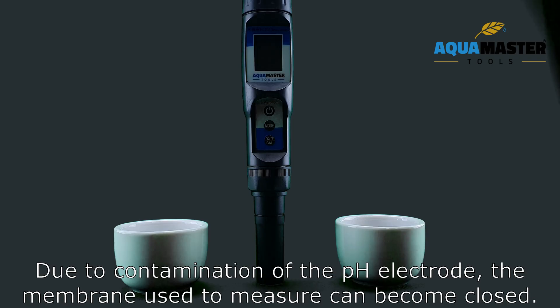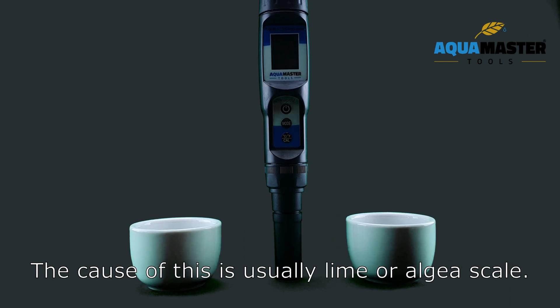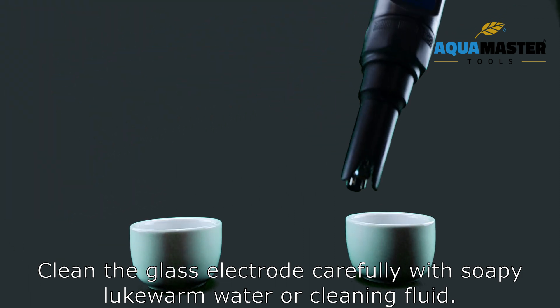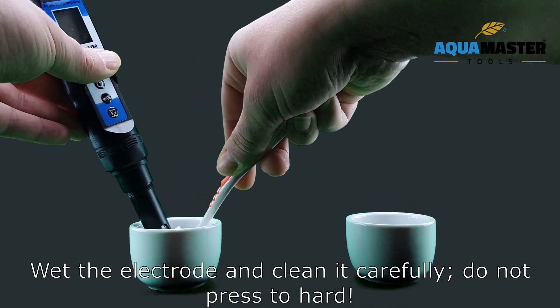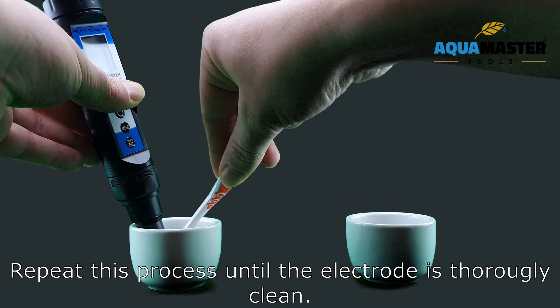Due to contamination of the PH electrode, the membrane used to measure can become closed. The PH value will then often stand still at PH 7.0. The cause is usually lime or ALB scale. Clean the glass electrode carefully with soapy lukewarm water or cleaning fluid using a soft brush. Wet the electrode, clean it carefully, and do not press too hard.